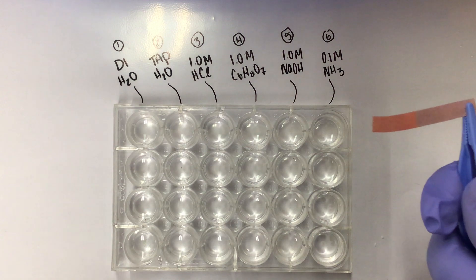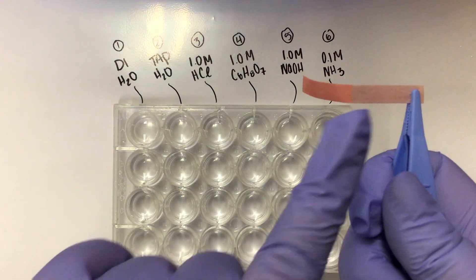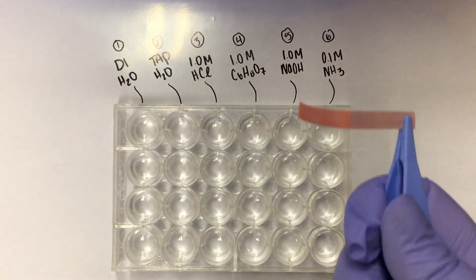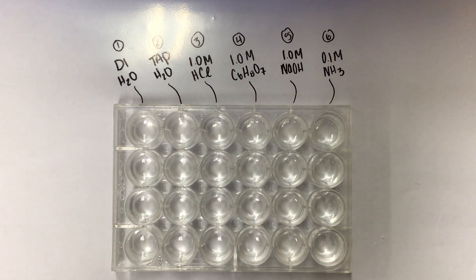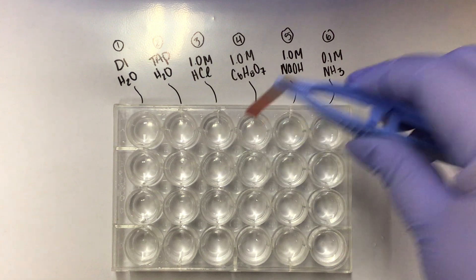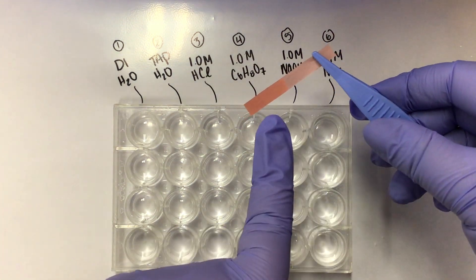It's a little bit difficult to tell on camera for some reason, but you can see two distinct colors there. This is the blue paper. This is now like a pinkish red color. Again, that distinction: blue paper, pinkish red color.